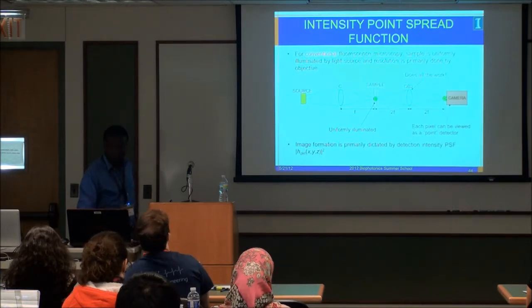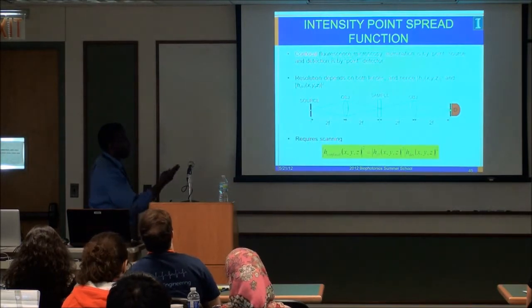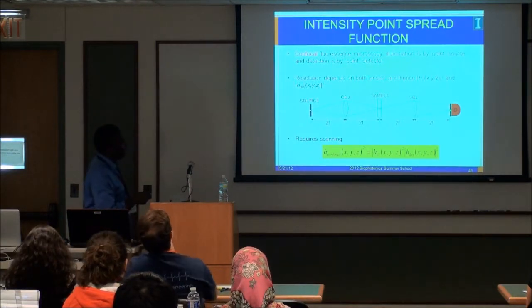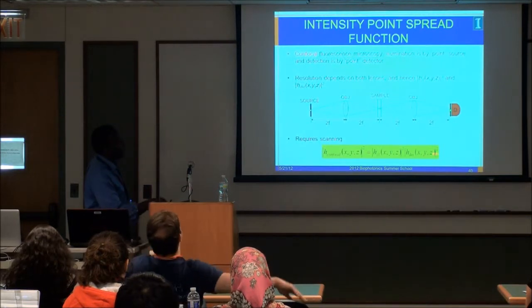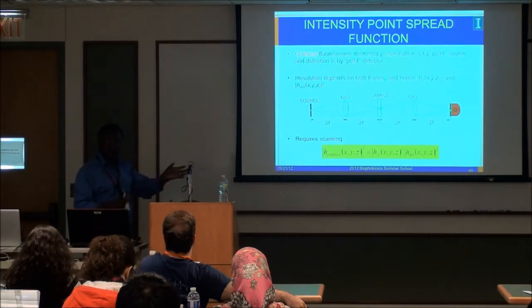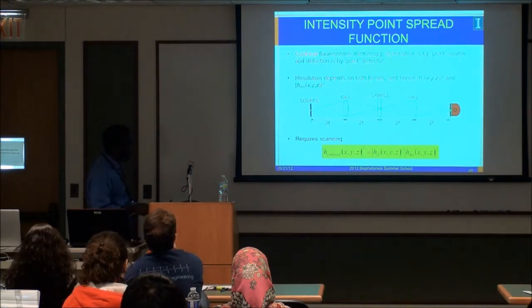microscopy. Okay. Now, if you look at confocal microscopy, this is almost a symmetric system. Okay. So both objectives are important. So illumination is by point source, and detection is by point detector. So you have illumination point spread function, detection point spread function, and you take the square, which is going to give you the intensities, because these are fields, and you multiply them by each other. Okay, so one can take a look at the different images you get with these different techniques. At the end of the day, I'll look at the big table of what the resolution is.